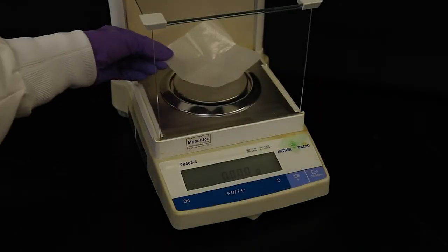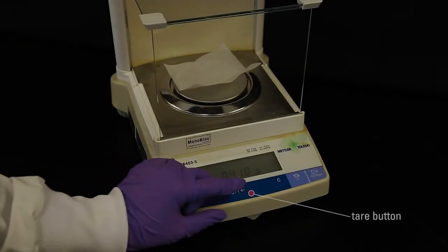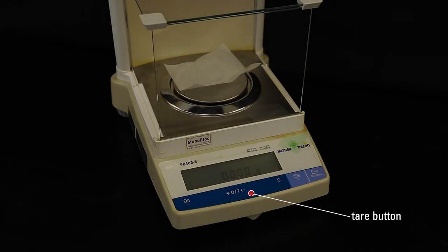Place the weighing paper on the balance. Then press the tare button to subtract the mass of the weighing paper. Wait patiently until the gram reader shows zero.